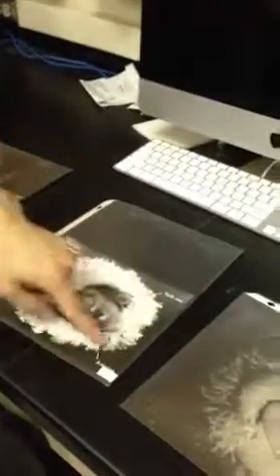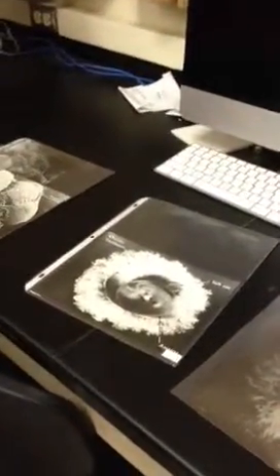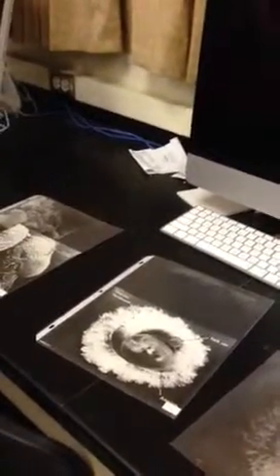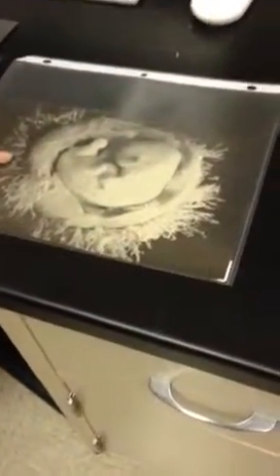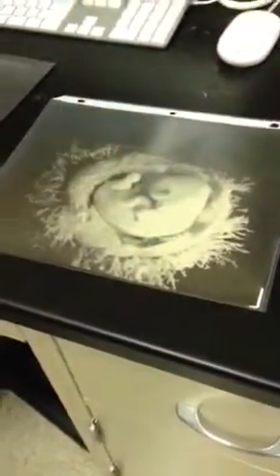Okay, so here's your amnion, right, that we saw in the other. But now you also see the chorion. So that's the thing that's actively invading the uterus to anchor into the tissues so that it doesn't float around anywhere. And this is where placenta will form and also need to anchor in. Same thing here. Here again, amnion. I think this is not a fresh one, but something different because it's all solid here. But chorion again around the sea urchin looking stuff.